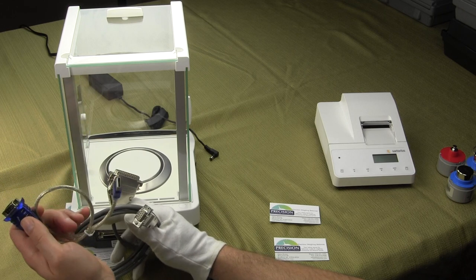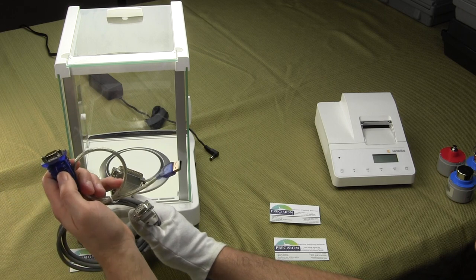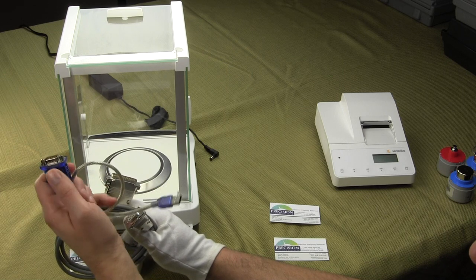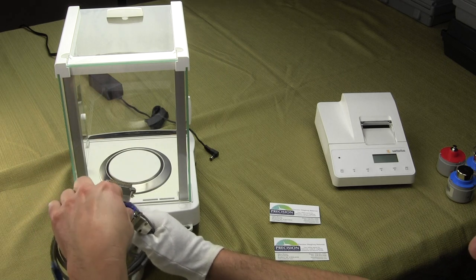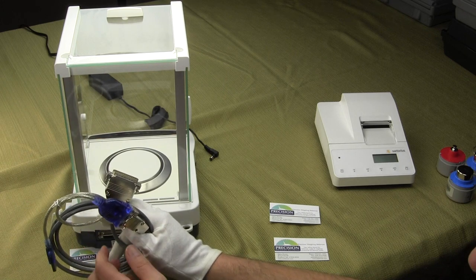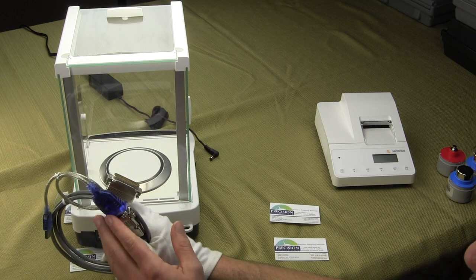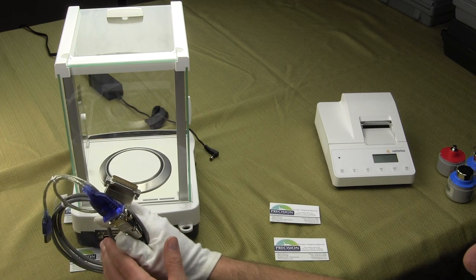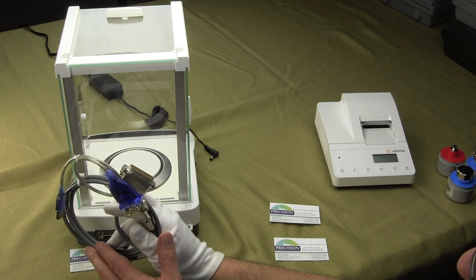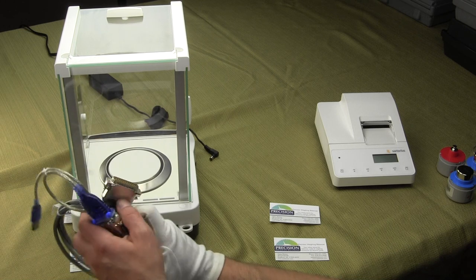Nowadays, they all come with USB. So we do sell the serial cable with this optional RS-232 to USB interface. You would just daisy-chain it together like this. You do have to load a driver, and it's basically emulating a USB. But this is one way to do data acquisition. Many people have bought this setup and it's worked very well for them.